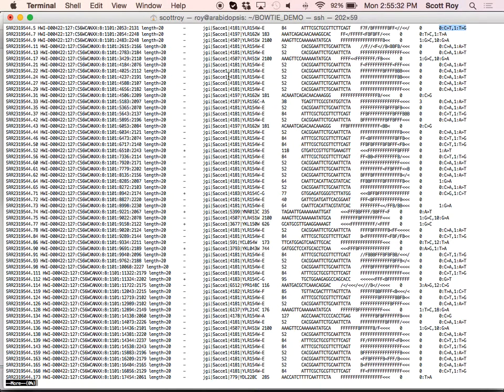And you can see already that if our question is how many reads map to each gene, then we could write a little tally script similar to what we did in class that would tell us how many times we observed each gene in our 1, 2, 3, 4, 5th column, just with a split and a hash. But I'll leave that to you.